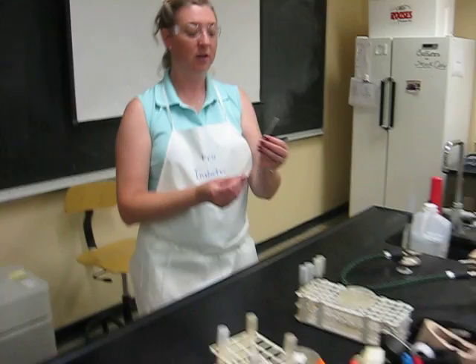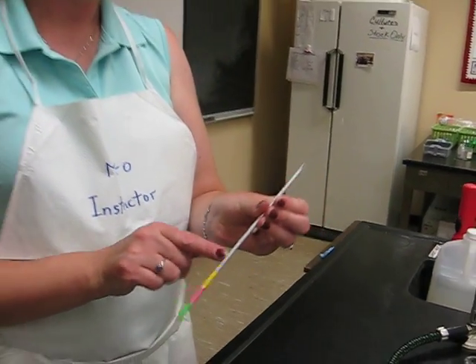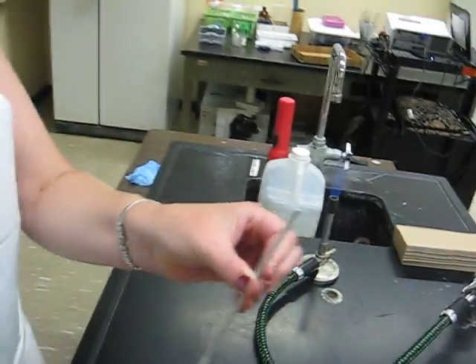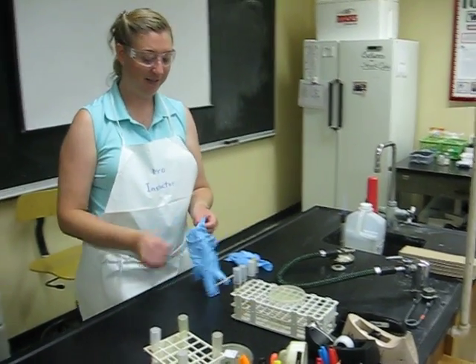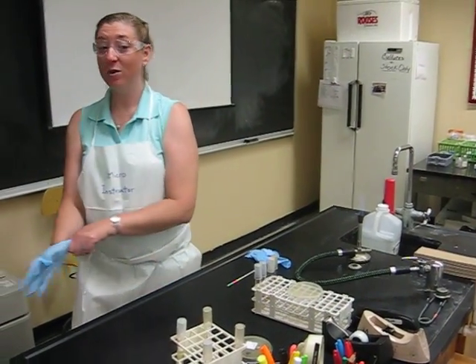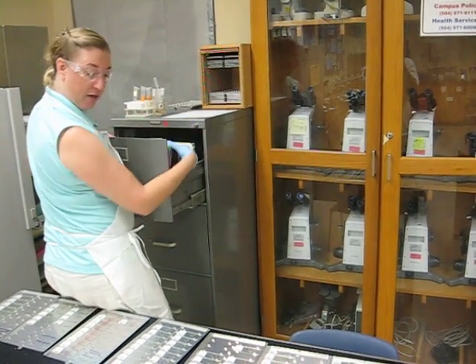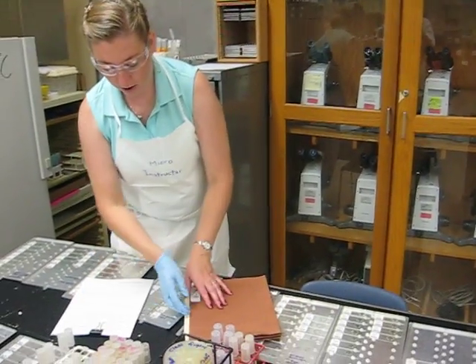This is a loop. This one's the instructor loop — if you have it, give it back to the instructor. It's color coded with three. You want to make sure that it's straight, flat, and relatively clean before heating it. Once you heat it, it'll be hot and you don't want to touch it with your hands. I have my loop and my Bunsen burner on. I'm going to put my gloves on — I'm going to be super cautious today. And then I want my procedure and labels.